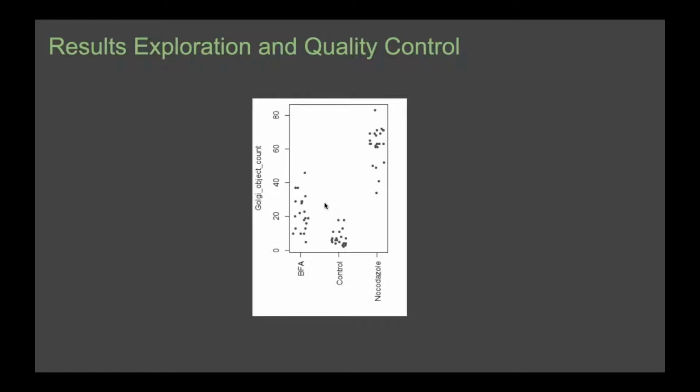Okay. The next question is, where does image registration fall in your workflow? It is usually used to get comparable data in medical diagnosis, or is it ever used at the biomolecular/cellular level? So I actually work a lot on image registration, maybe one of the main things, in fact, since recently. It's typically maybe even the first step of your pipeline. For example, we have here a screening project where people look at Drosophila, and it's 3D data. They have thousands of 3D images of Drosophila, and they lie in kind of random orientations on the microscope slide. So really the first step is to get all of them in the same 3D orientation.